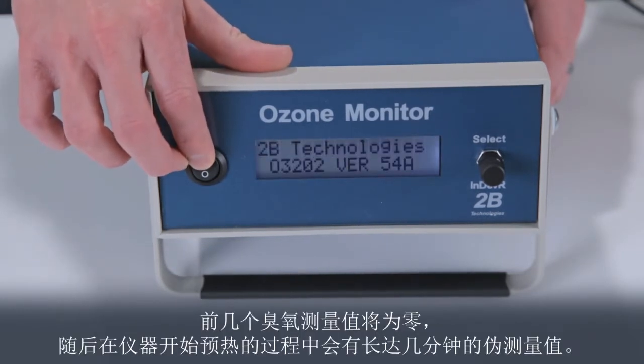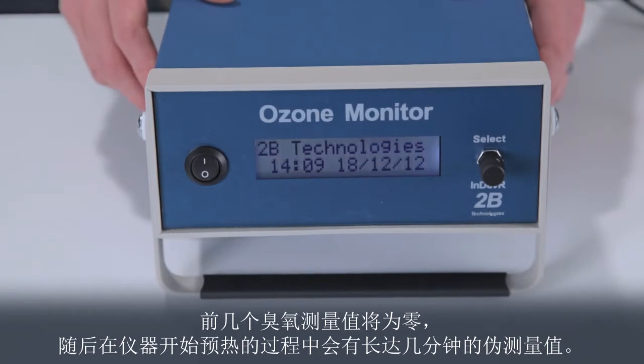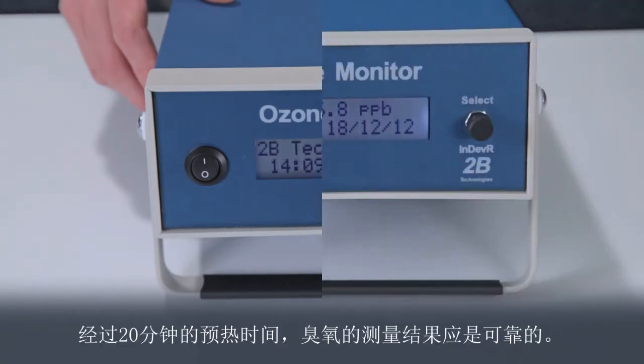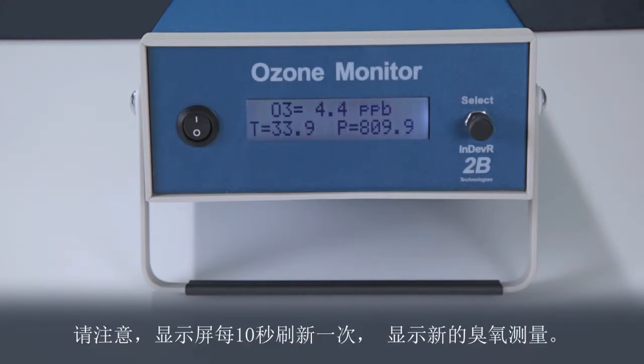The first few ozone measurements will be zero, followed by spurious measurements for up to several minutes as the instrument warms up. After a 20-minute warm-up time, the ozone measurements should be reliable. Notice that the display is refreshed every 10 seconds with a new ozone measurement.